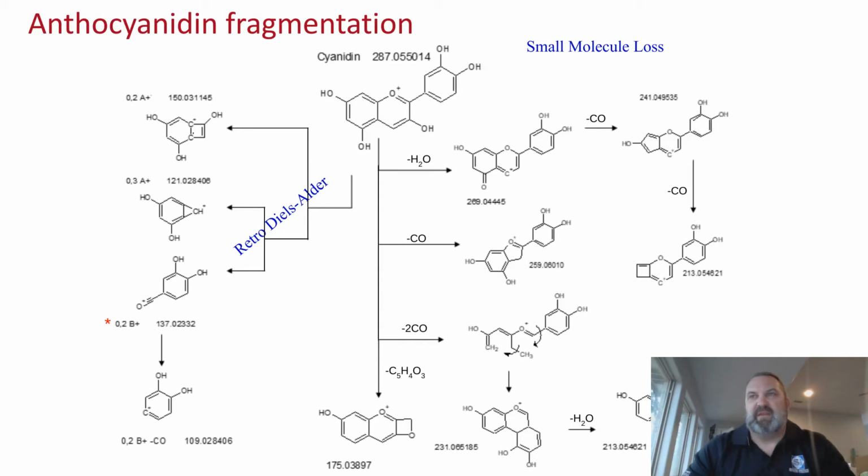And I think that the key take home here is that we know the mass to charge ratio, those numbers associated with each one of those fragments. And so we can go looking for those in our sample and have them be somewhat diagnostic of this particular molecule if it's present. And obviously, if we see more than one fragment, that's even better evidence.